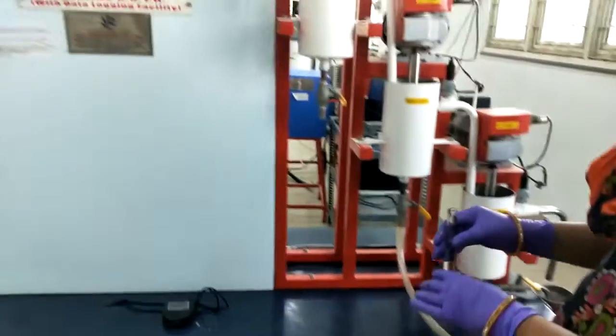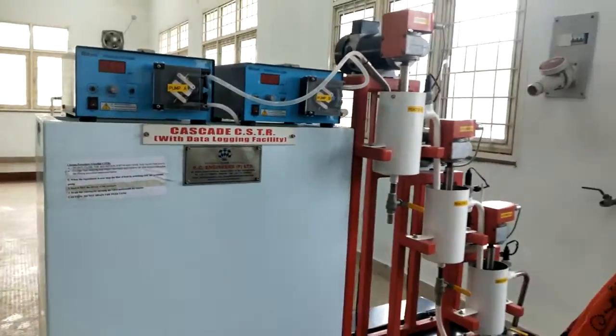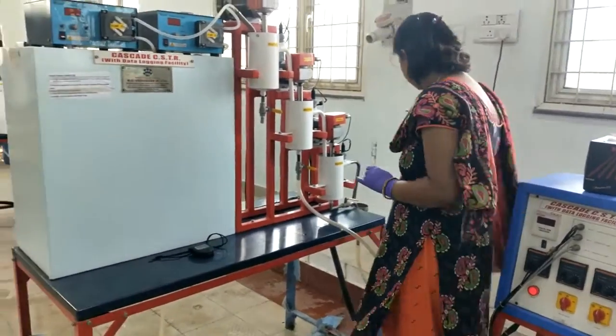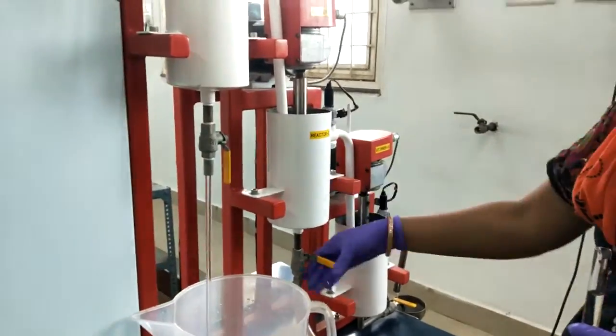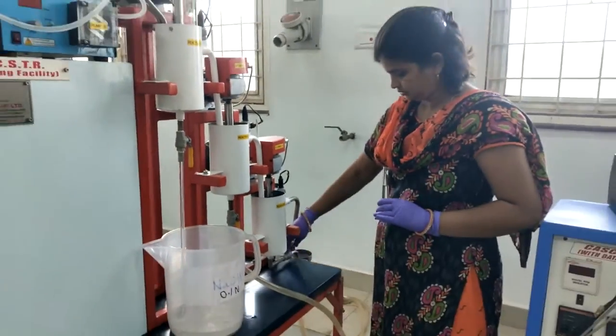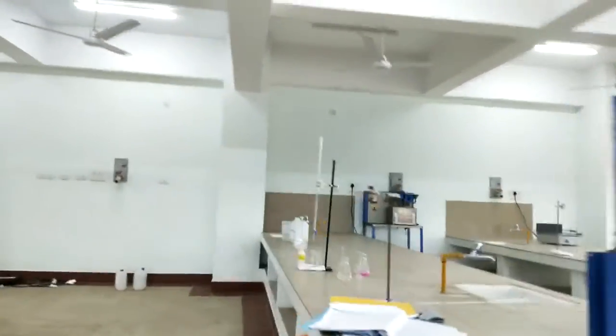Okay, and switch off the motors and empty the tanks before starting the titration. So we will discard all the chemicals. Now we will do titration against NaOH.